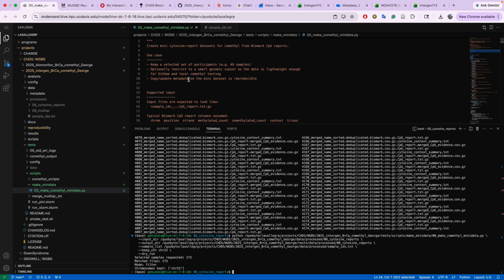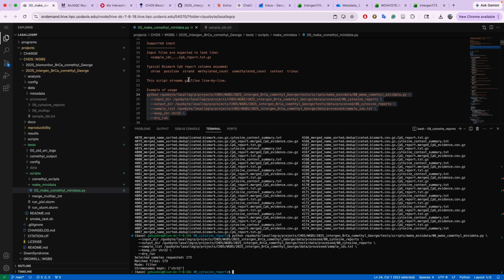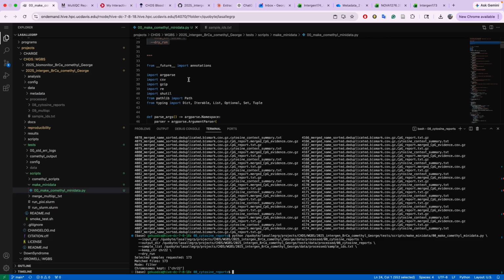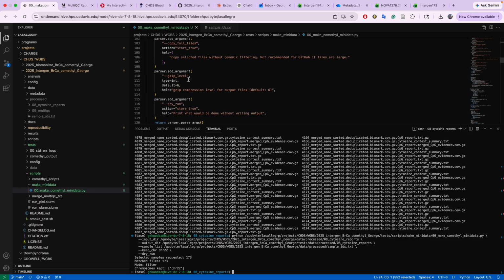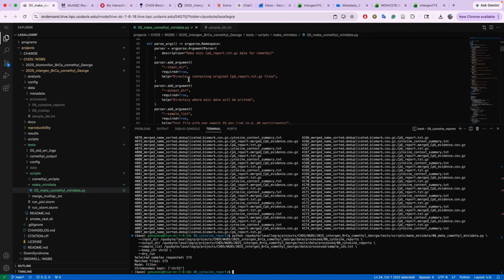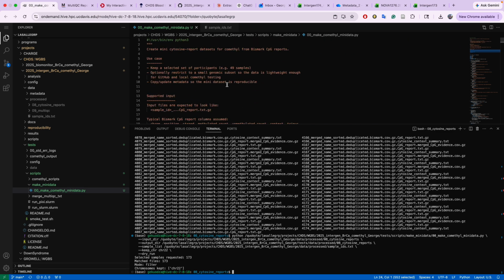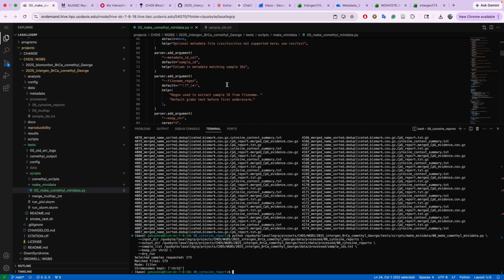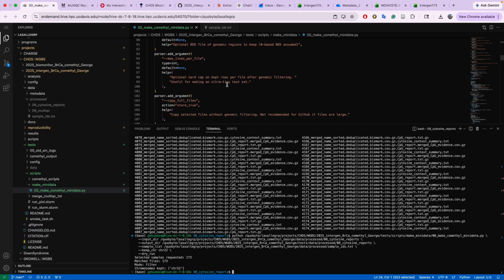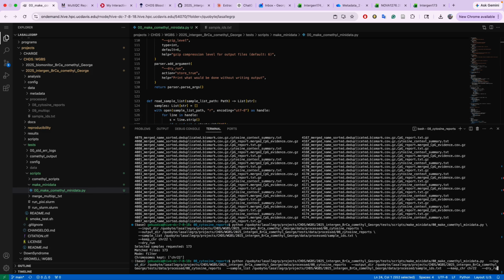Okay. And I think there should be ways of, if you wanted to, adding a bed file with different regions, but to keep things simple. And then the specifics about the Python script you can troubleshoot with AI on your own time. But I just wanted to get this. So that was a dry run. Let me just double check the other arguments. Okay. So I think I'll just delete the dry run part, and then I should be able to.